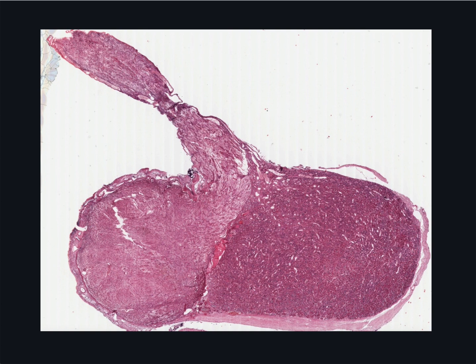Pituitary hormones are glycoproteins and simple polypeptides. The periodic acid-Schiff reagent stains the hormones that are glycosylated and not those that are simple peptides without sugar moieties. Since this leads to some cells ending up purplish while others are orangish, the conventional appellations of basophil and acidophil have really been inappropriately extended to them.